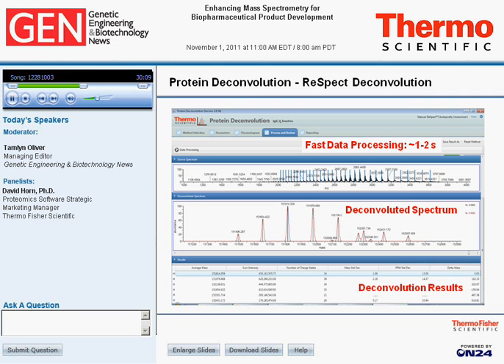So if you click on any of the rows in the table, you will highlight the peak in the deconvoluted spectrum, and you'll also highlight all the peaks in the original spectrum that was used for production of that deconvoluted spectrum. One thing you can do is there's a little plus sign on the far left of the table. You may not be able to see that with your screen resolution, but once you click on that plus, another level of the hierarchy of the table will show up with the list of all the charge states that have been detected for each of those deconvoluted components.